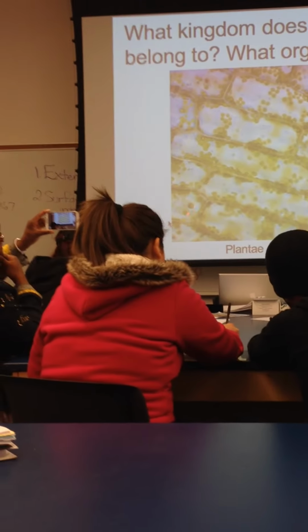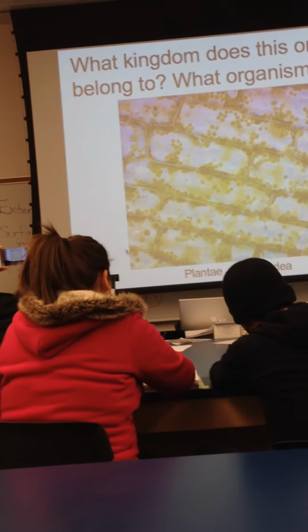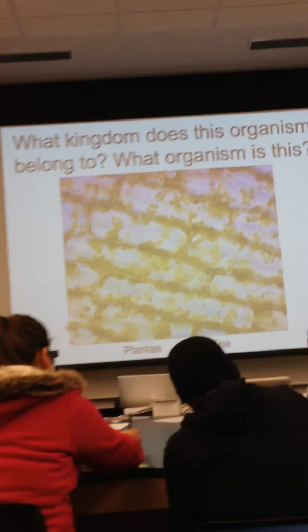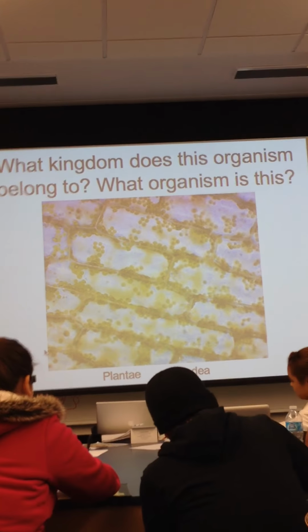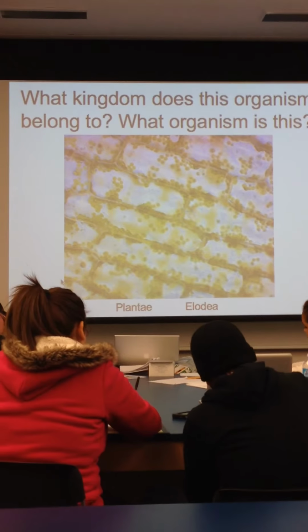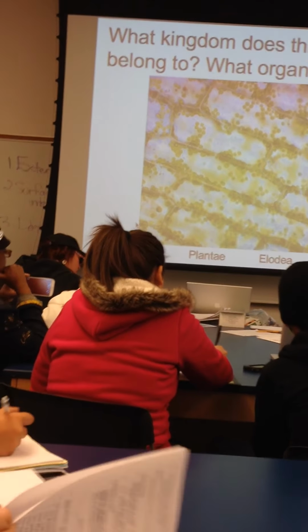Nucleus down here. Okay? The bigger guy is the nucleus. Sometimes they get obstructed by the chloroplasts. But remember, in plant cells, the nucleus gets pushed off the side because the central vacuole is in the middle. You can't see it in these because it's transparent. Okay, so if you're going to take a photo, take it now.